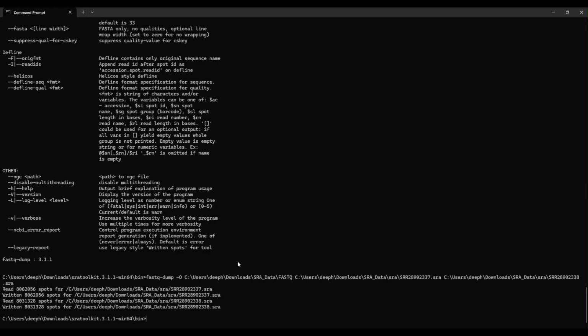You can also use fastq-dump directly and overlook the prefetch command. It will download the SRA file and will convert it to fastq, and at the end, the SRA files will be removed. Let's check it.